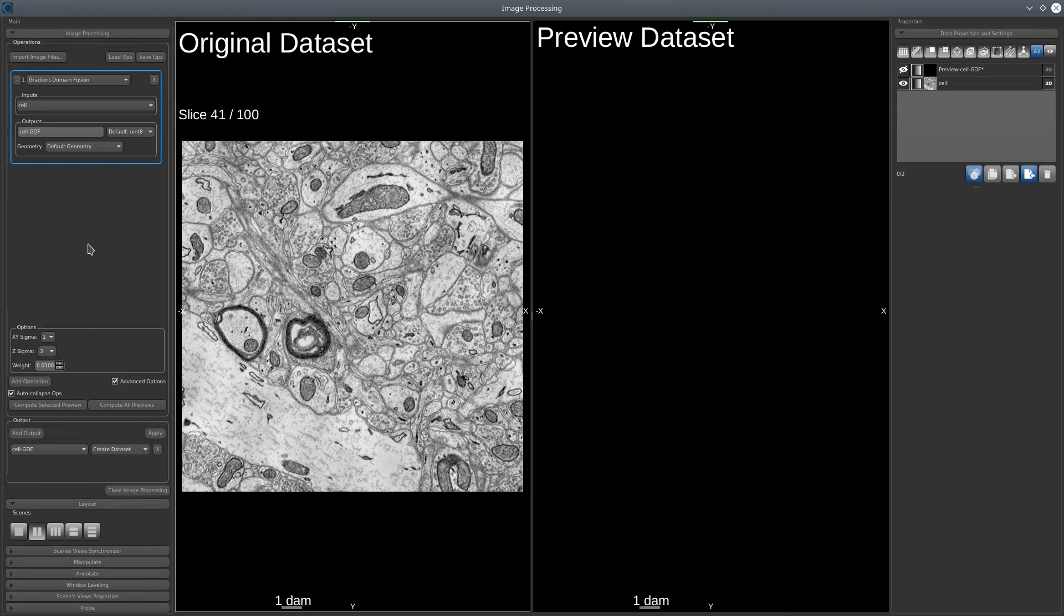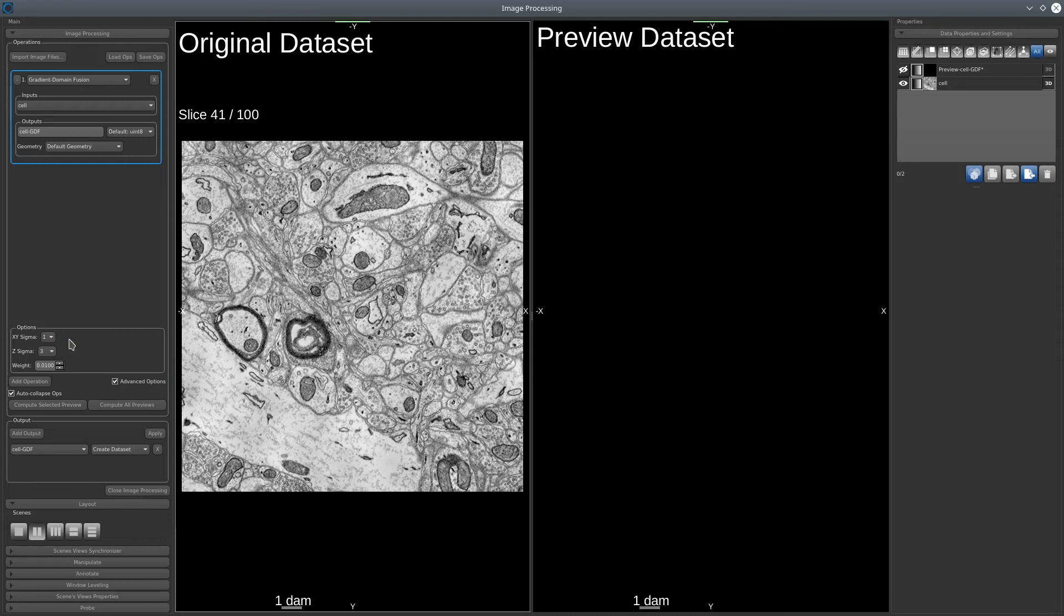To execute this filter, we'll have three parameters to set. First of all, we need to select the X and Y sigma. For this dataset, one is enough.